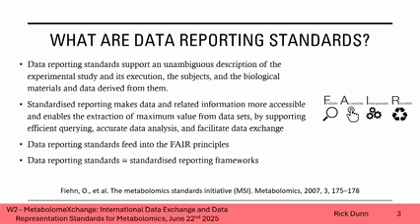And from that, you can ask different questions. And it's important, within open data, each of us might want to ask different questions. So we have to think about that. I'm an analytical chemist, I'm thinking about how can I use it for aspects of that. There might be other biologists who want to use it for aspects of that. So we need to consider all of those. So it's standardized reporting, basically.